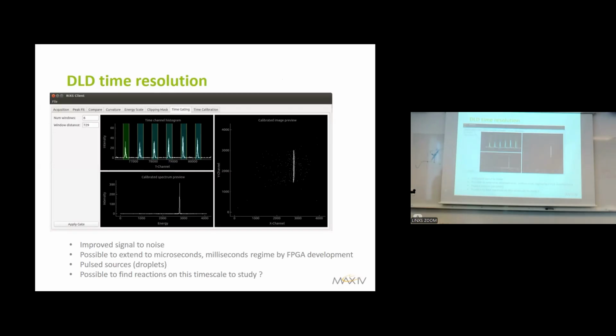This is how it manifests in the software. So as you know, a synchrotron is a pulsed source, which means that we essentially have X-rays passing by every 10 nanoseconds. We have 100 picoseconds time resolution, so this is something we can easily pick up. So we just look at where the X-rays come, and we see only events coming at these times. This means all of this is background. So we can then fold this and only allow spectra within this time region. All the rest we can get rid of.